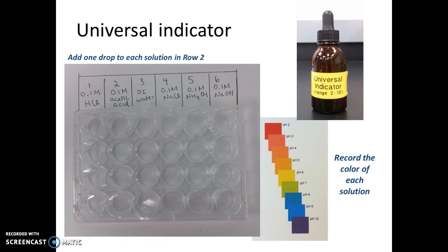The next test uses universal indicator. Fill row two on your test plate two-thirds of the way full with solutions one through six, then add one drop of universal indicator to each well in row two. You'll get a colorful response — the color chart is similar to that of the pH paper, with strong acids on the red end and strong bases appearing blue and purple. Record the color of each solution in row two.